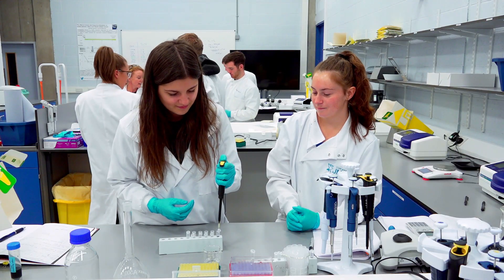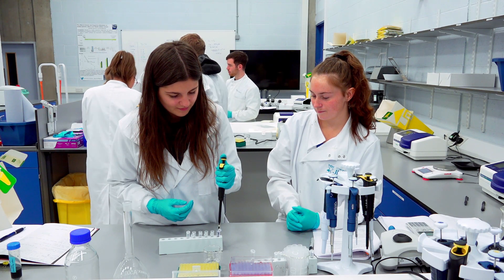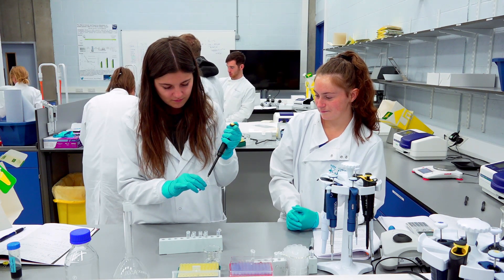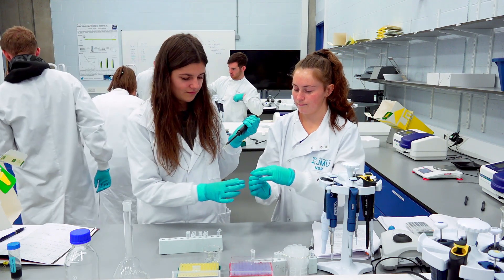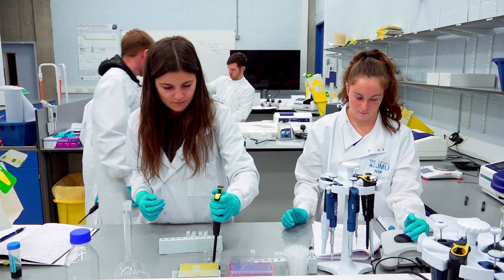Here they're doing a process called serial dilution, and this is a way of making a set of standards. You can see we're transferring a concentrated stock solution, which is a blue colour, into the same volume of water, so each time the liquid is transferred into the next tube the concentration is halved.